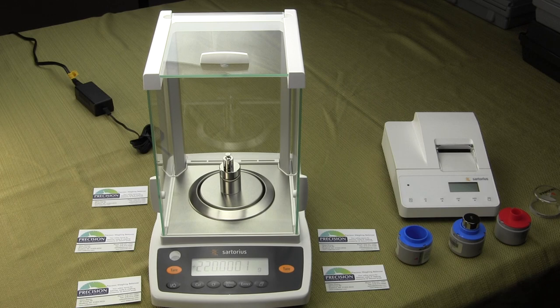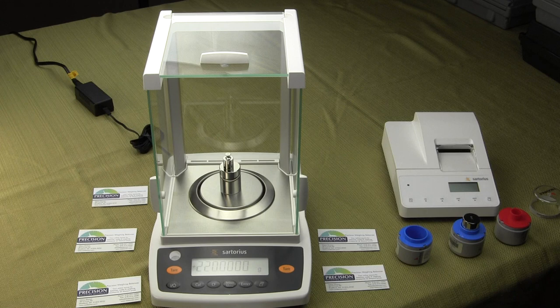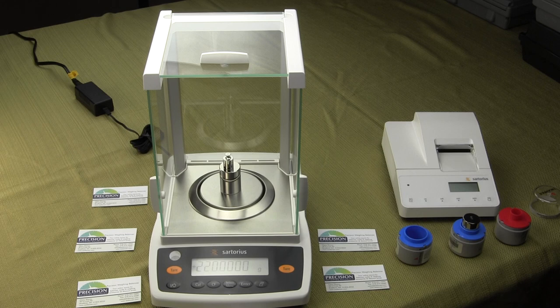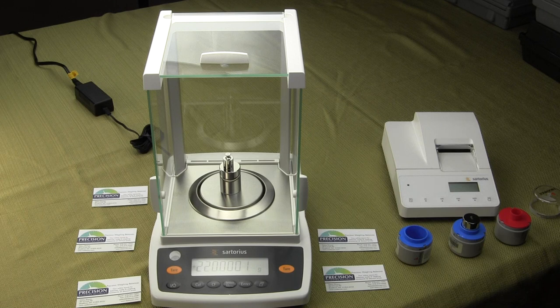The new series also has a new microprocessor in it. It's a very nice balance with Sartorius' monolithic cell, so you're going to get great performance. Right now I have 220 grams on the balance and you can see how well it's reading. I have a lot of powerful lights around this that create electronic noise, yet the balance is performing spectacularly.